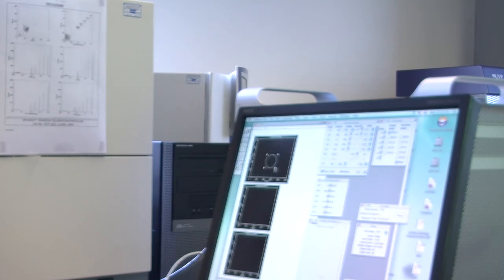Move that to there. Start. Pause. Right, I have to do this reasonably quickly because it is still running sample through, and I want to have enough to run. Let's do that down to 500. So what I'm doing is I'm just adjusting the settings.